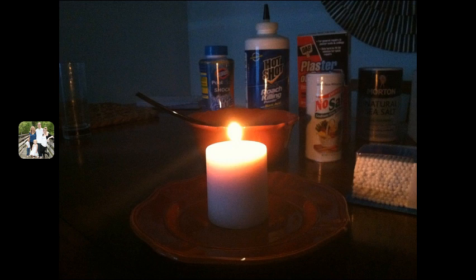In my experiment, I needed a control group. My control group was the color of a normal flame on a candle, which is seen in this picture. From this picture, I can determine that the normal color of a candle flame is white in the center with a light yellow edge.